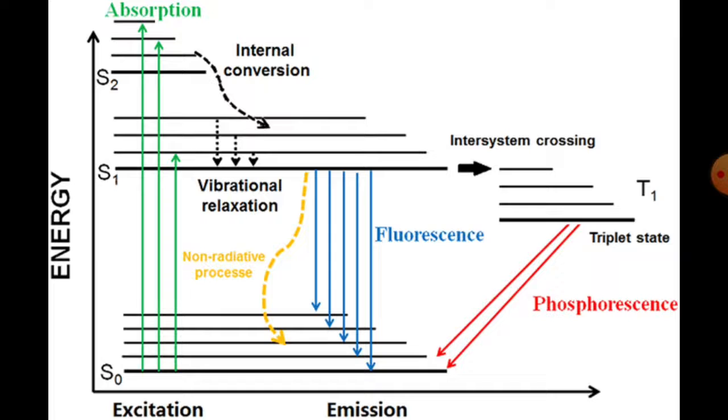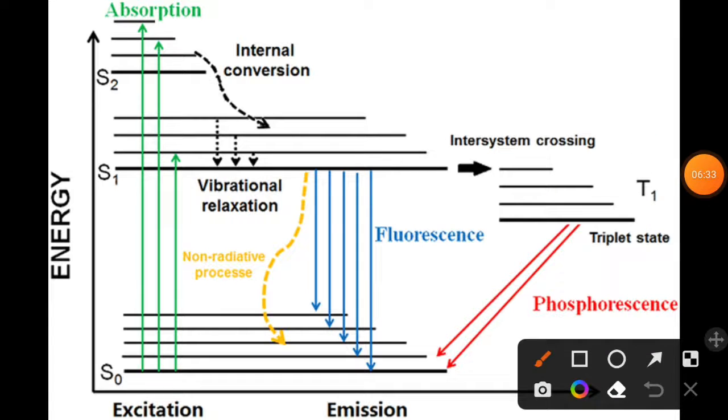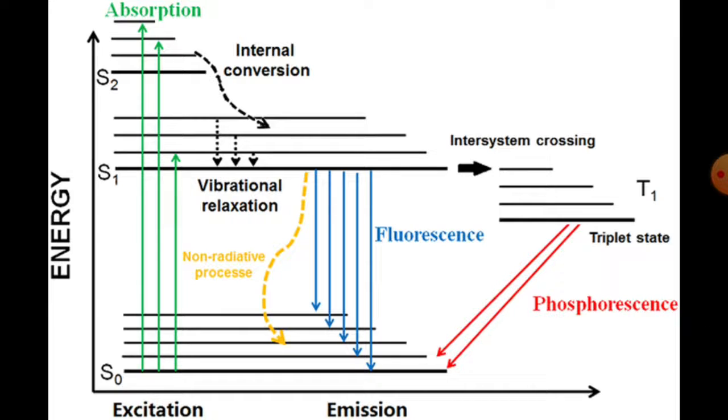This kind of staining is quite different from the normal staining we discussed in lecture number 2. Here we are using fluorescent staining, or fluorochrome staining. We will also discuss the various stains we use, especially for fluorescence microscopy. So let's discuss the principle on which a normal fluorescent dye works.